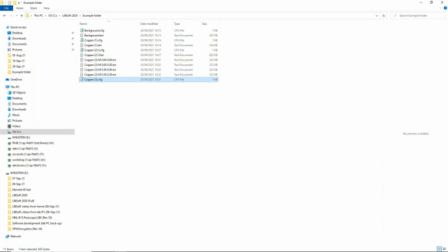Note that if a manually controlled sample chamber or no sample chamber at all is used, but multiple measurements are specified, an integer will be added after the M suffix instead of the coordinates shown here, starting with 1 for the first measurement and incrementing by 1 for each subsequent measurement. Note also that if multiple measurements each comprising multiple spectra are specified, then the resulting spectrum files will include both the M suffix plus coordinates and the S suffix to indicate that each file contains multiple spectra. As before though, only one configuration file will be saved, as the same parameters were used to acquire all of the specified spectra.